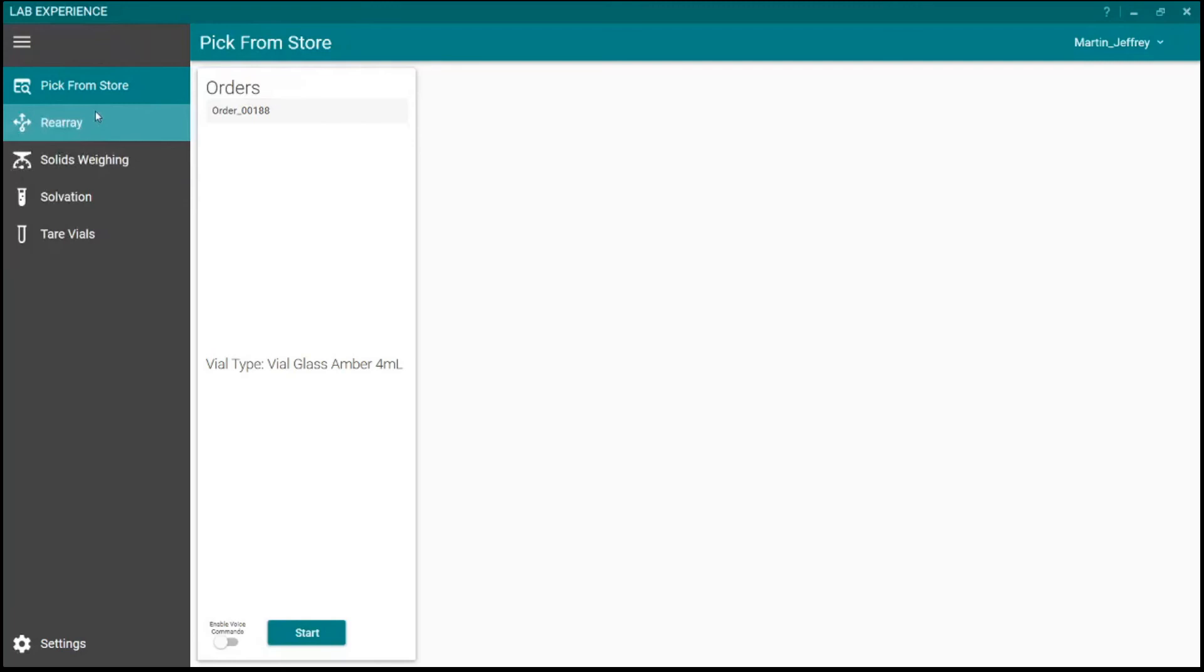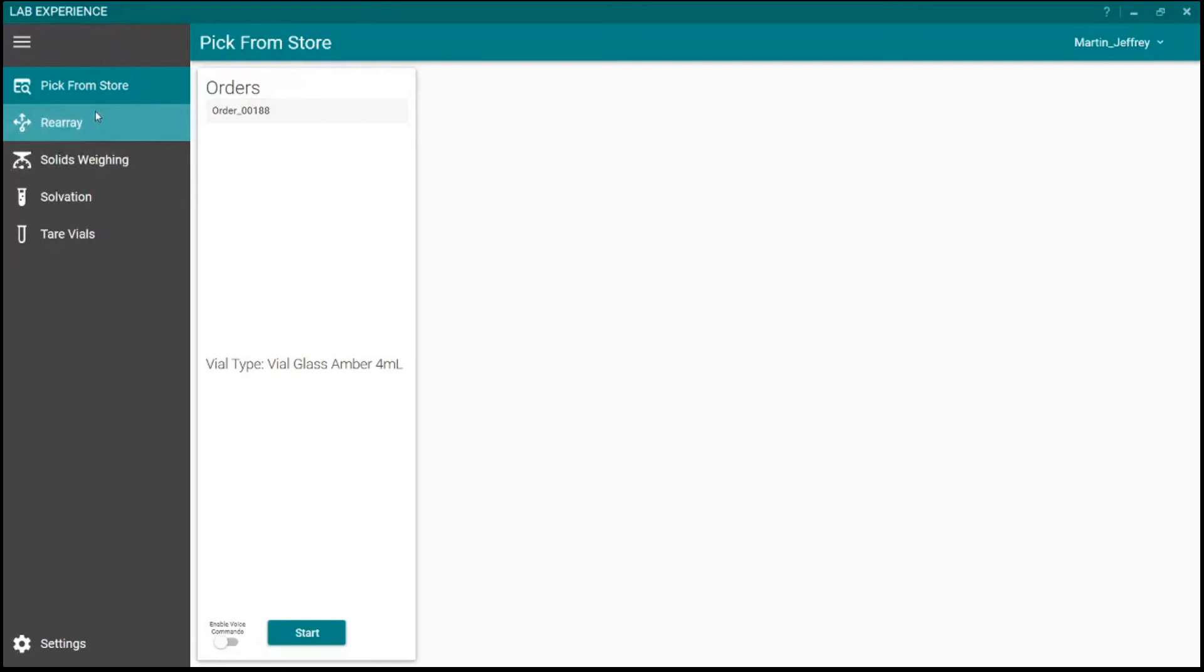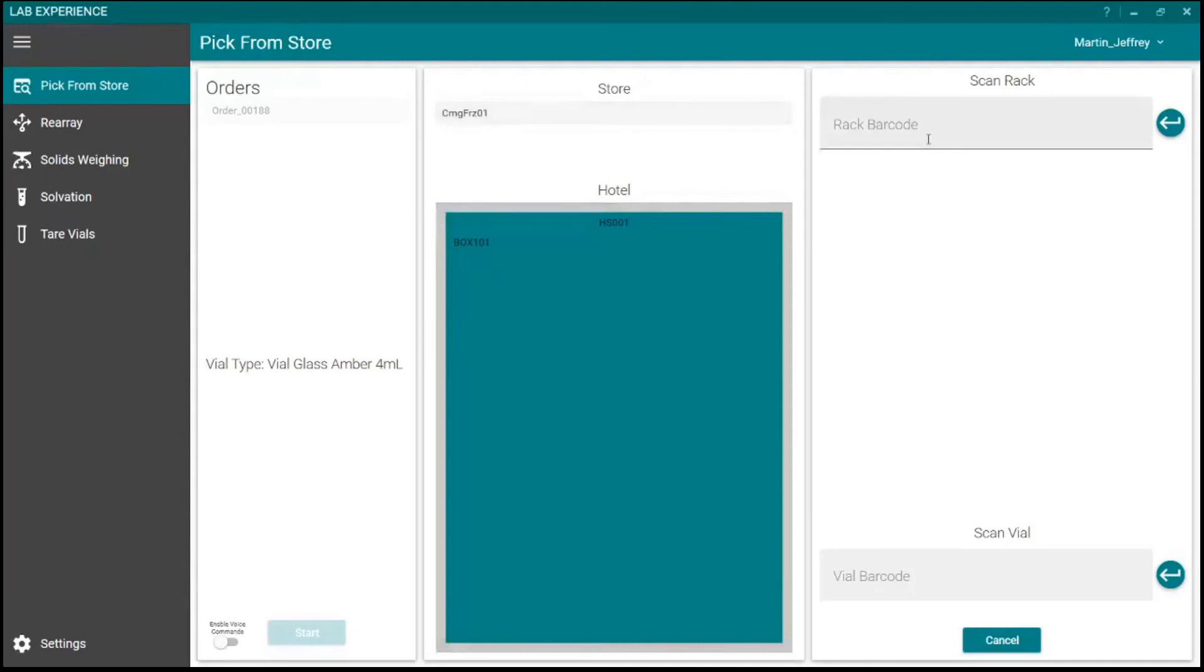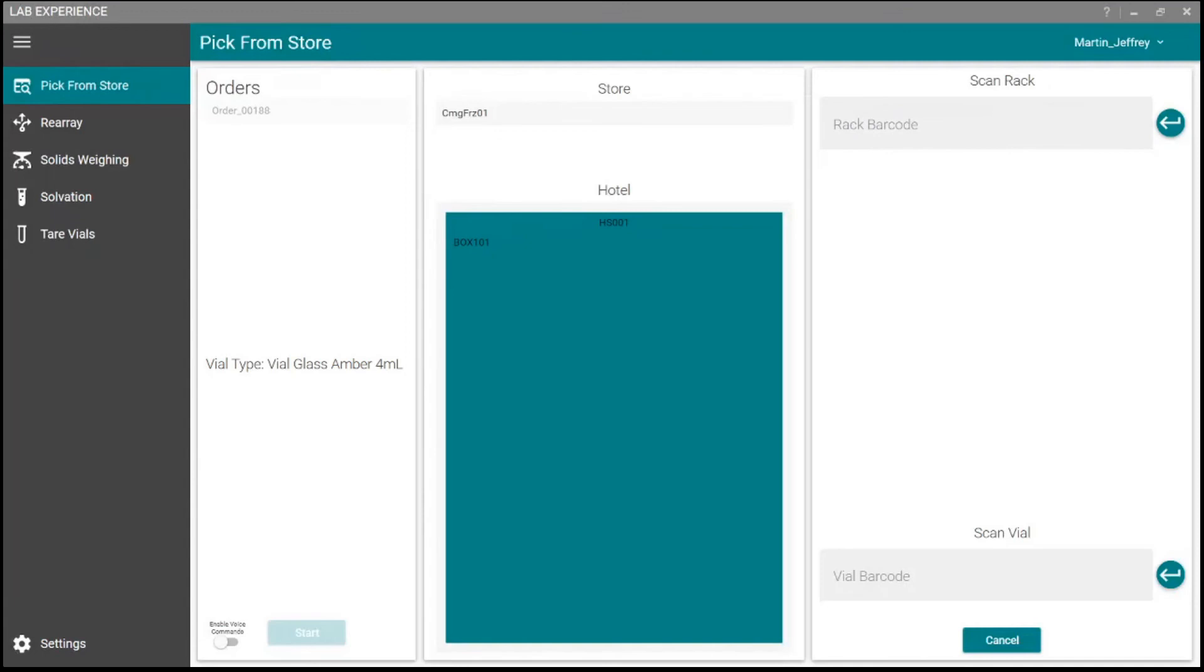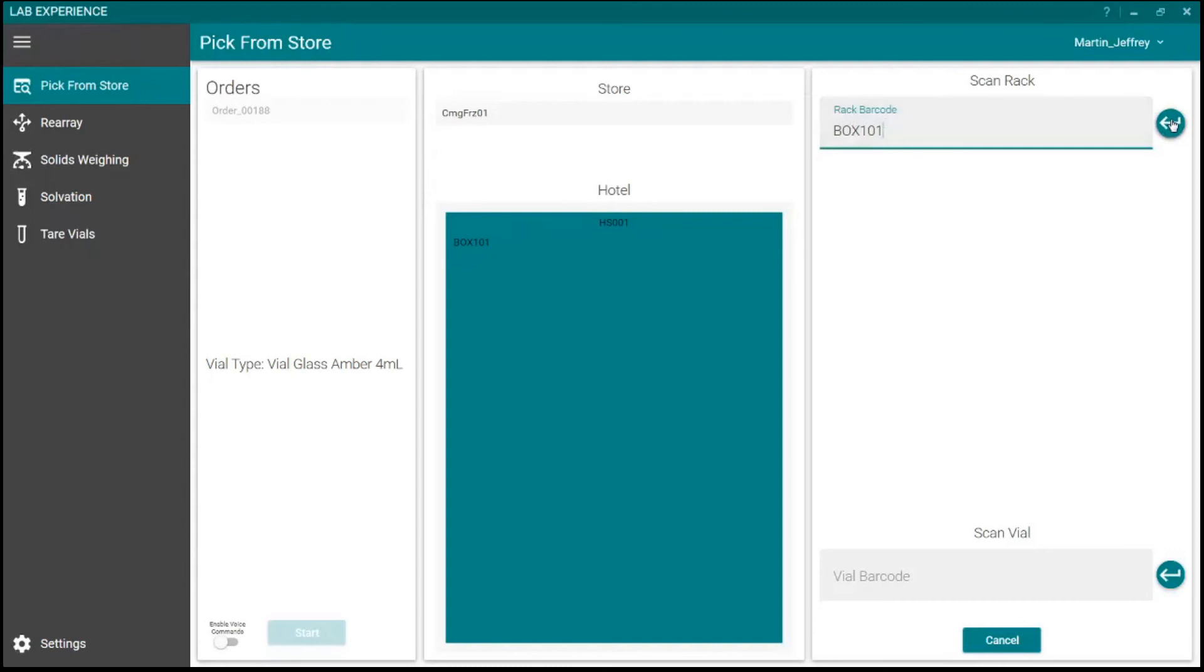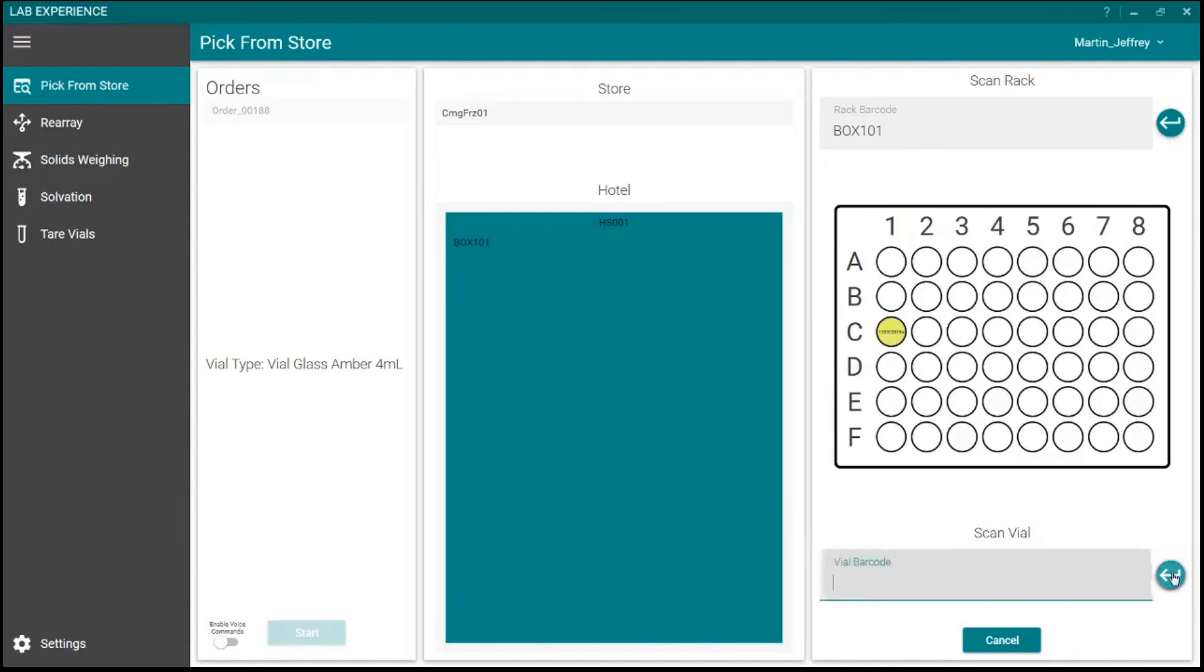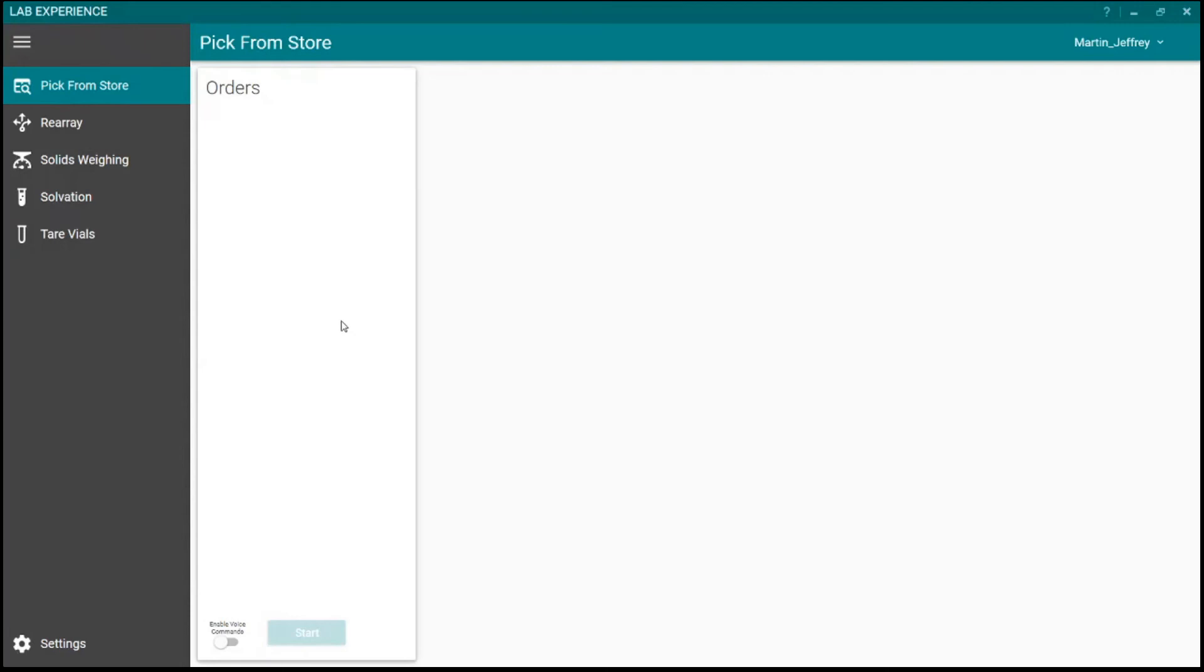So now that we've created this order, the user in the lab will then go and process this request. If they process the request, first thing that happens is it says we have pick from store as the first step. So this is where the Lab Experience stuff comes in. So let's look at Order Manager. Notice we have this task that's popped up. Pick from store. So now that we have this, we know that if we go to Lab Experience, each of these is a different app. Pick from store, solids weigh, etc. Each of these would live at the station wherever the work is being done. So if we go to pick from store, we can see we have this order. And so if we start this, first thing it says, here's the freezer that we're in.